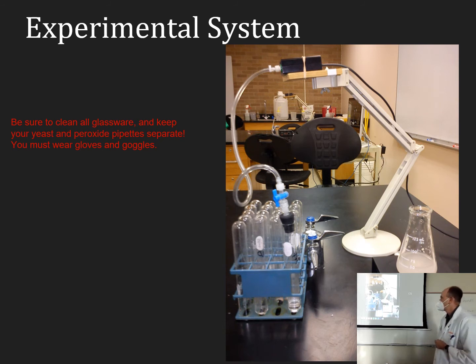Okay, so a few suggestions for today before I move on: be sure to clean all your glassware, like rinse it out before you use it, just in case someone didn't clean it out very well, because sometimes students leave the stuff contaminated, and then we get the chemical reactions happening before we even try to collect data, and you get nothing and it goes nowhere, and it's frustrating. And we're going to need to wear goggles today, and we should wear gloves as well. Not that 3% peroxide is real dangerous, but just to keep you safe. And then sometimes test tubes explode in this lab, not terribly commonly, but they have, and we don't want to get glass in our eyes.